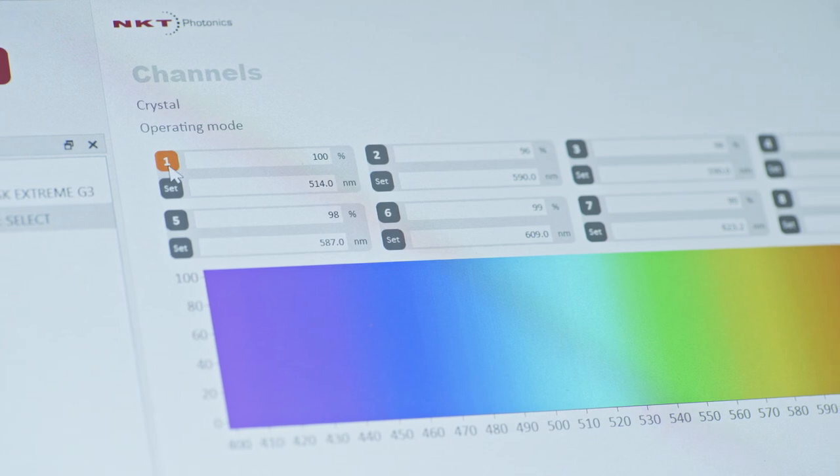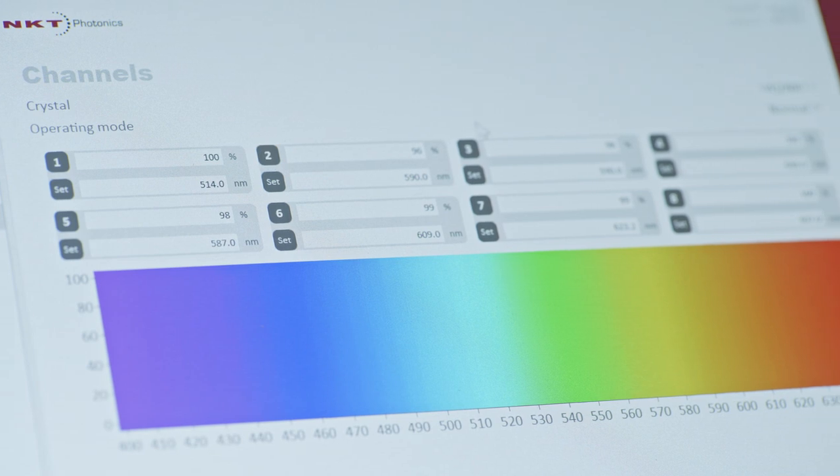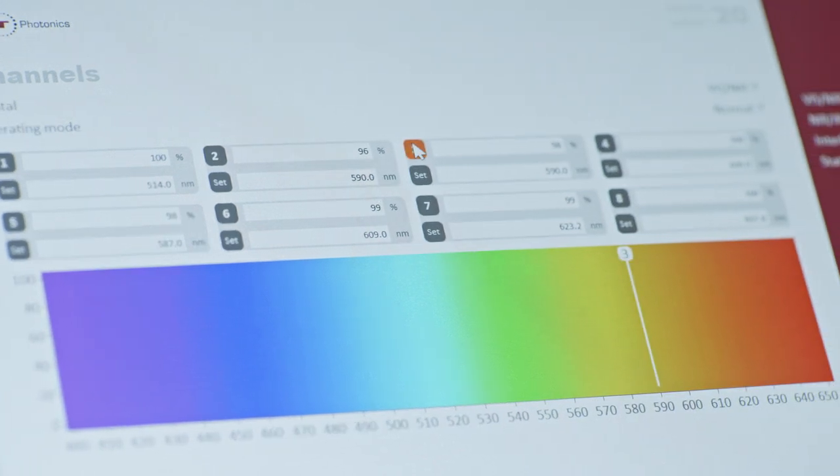You can add up to eight colors. Here I'm showing four colors added one by one.